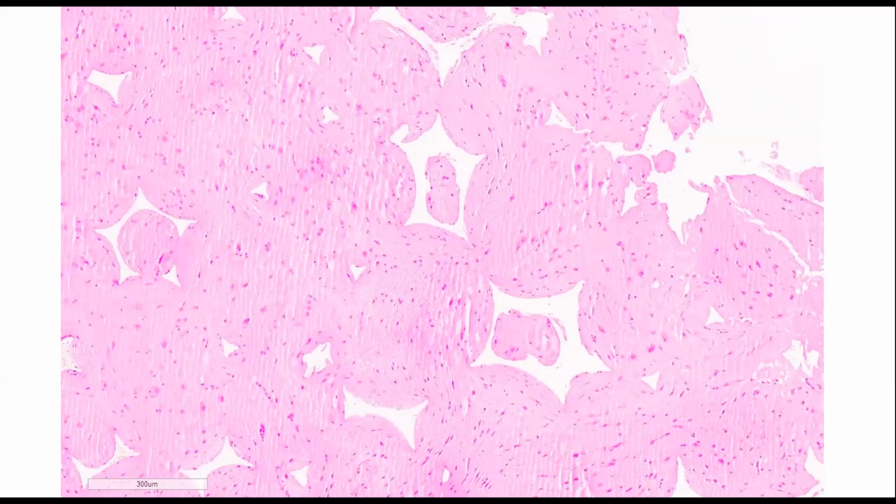Blue sponges are great for GI biopsies. They're not good for brain and brain tumors. Super soft, they get sucked into the blue sponge, and we're already dealing frequently with stereotactic biopsies or even smaller endoscopic biopsies, and if you distort that tissue, it's like game over.